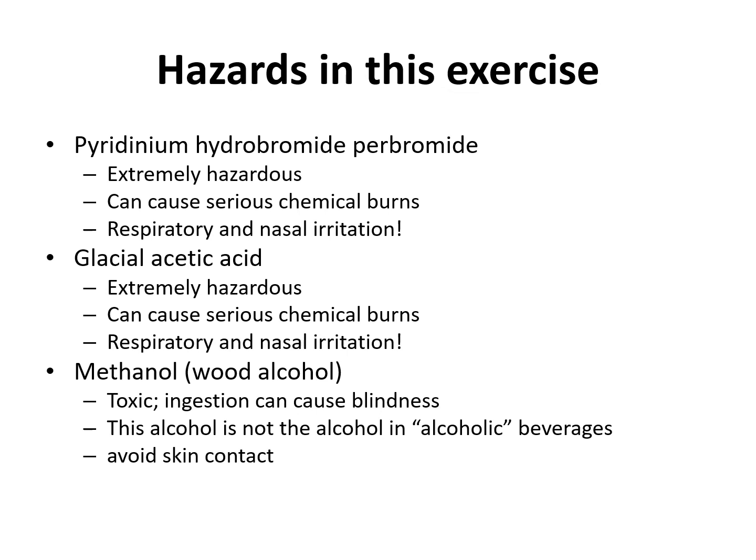Again, in the lab, we use alcohols as sanitizers most of the time, or we normally use alcohol to clean certain glassware and equipment.